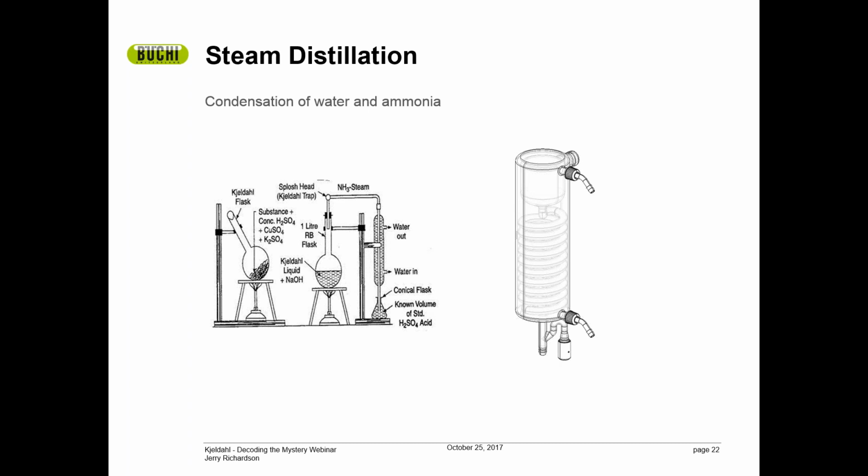So most commonly people will use one of two methods. One is tap water and the other is a chiller. There's advantages to both, and there's clear disadvantages to both as well. With the chiller, obviously, it's an additional cost, where water through a tap is cheap. But you do have other considerations to take into account. The first of which is where you live in the United States.